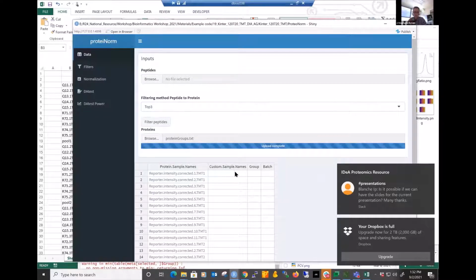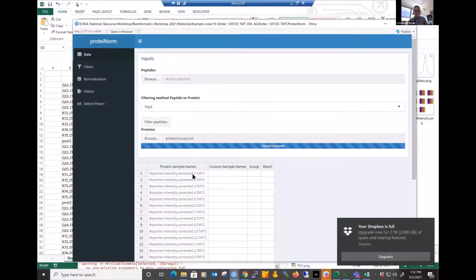If you didn't use TMT and you have a different structure, you're just trying to make it populate a file, you can label each of your columns of sample intensities as intensity followed by something like .1, intensity .2, something like that. It's just going to look for that intensity. And all of that description is there in the GitHub.